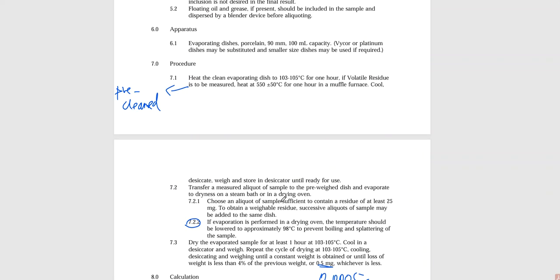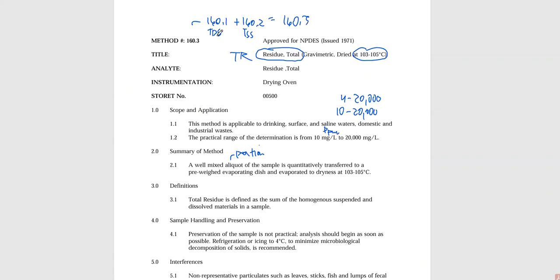Details matter. And here, getting used to a method, getting used to kind of the first time that you're seeing proper methods being implemented, following directions as they're written, that's going to be more important than some of these proper definitions that you might see. A little bit later down the road, we'll clear that up. All right, so those are the differences between 160.1, 160.2, and 160.3.